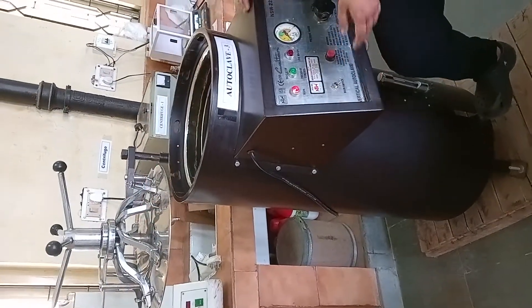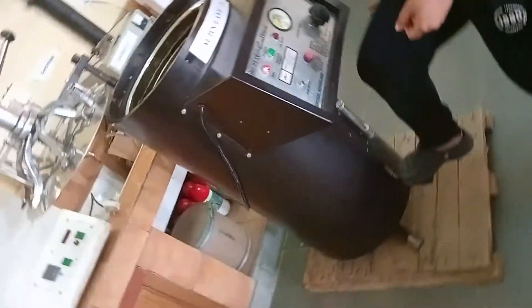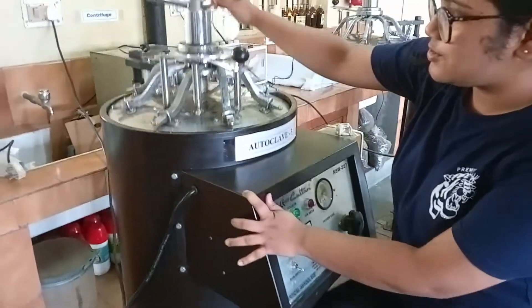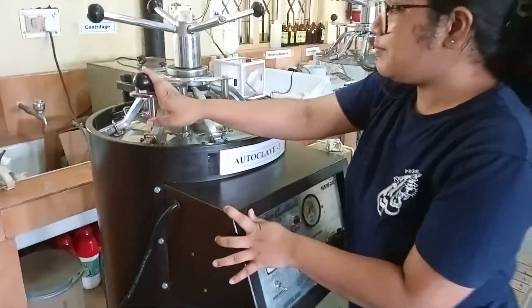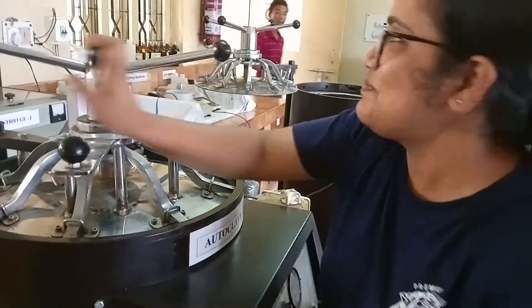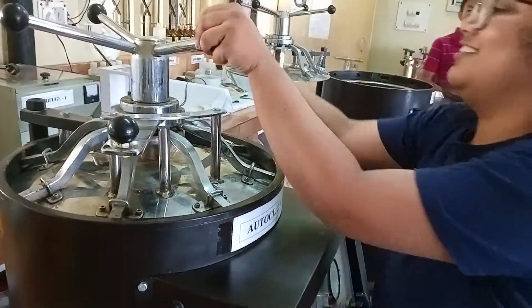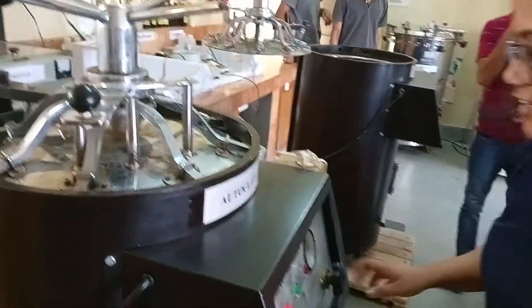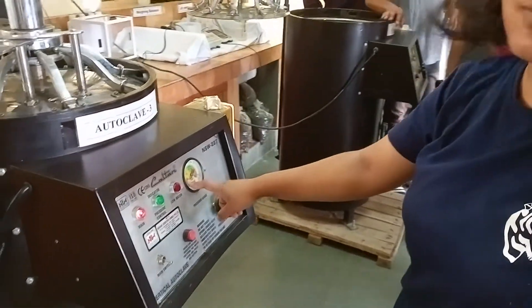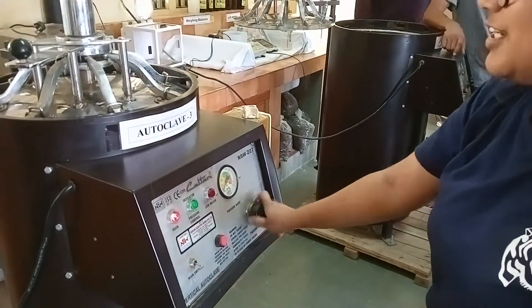For closing the autoclave, just stamp on this one. Then tighten this pressure box. After it reaches 5 here, just release the pressure.